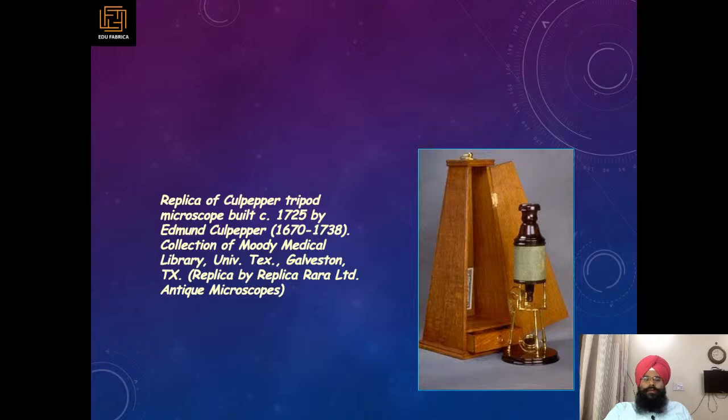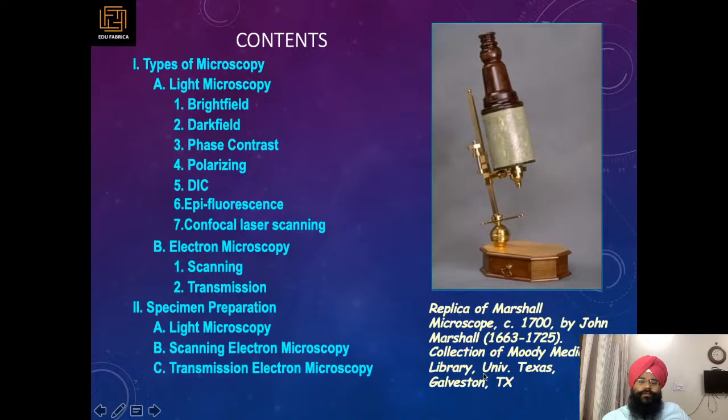So you can see how nicely the wooden construction is done to the microscope. And this is a replica of the Marshall microscope by John Marshall, with the collections of Moody Medical from the Medical Library.